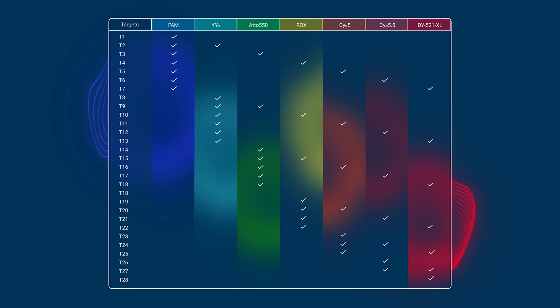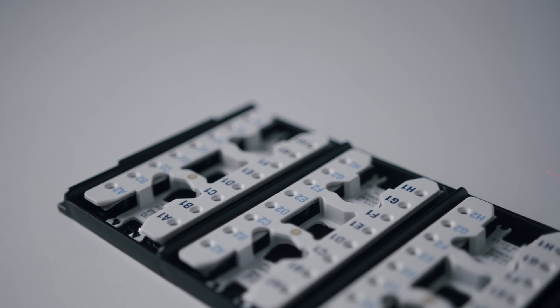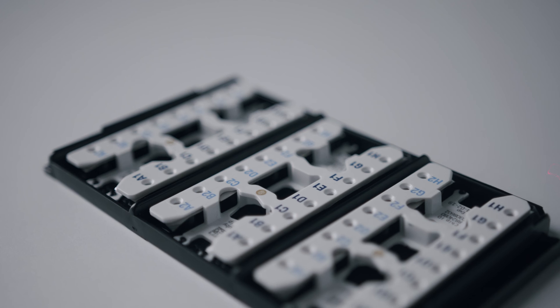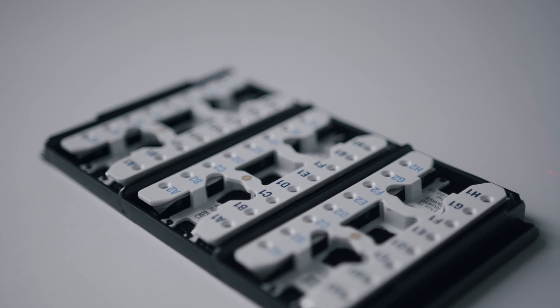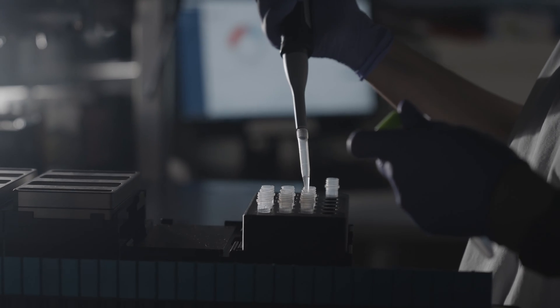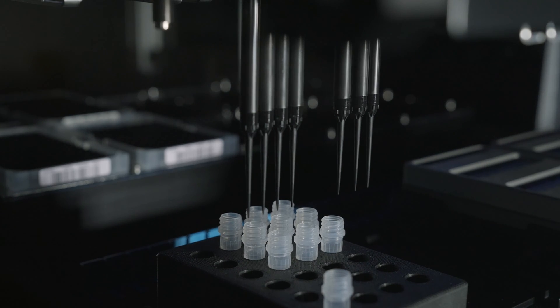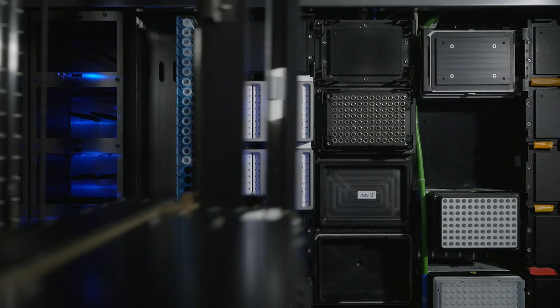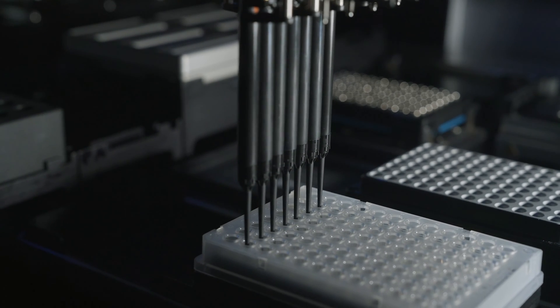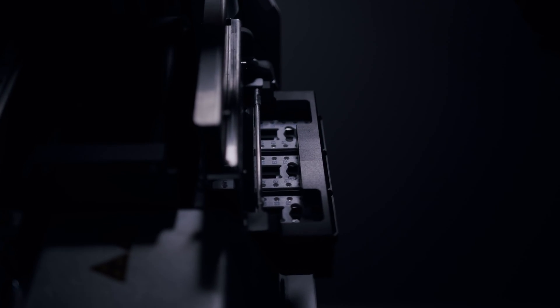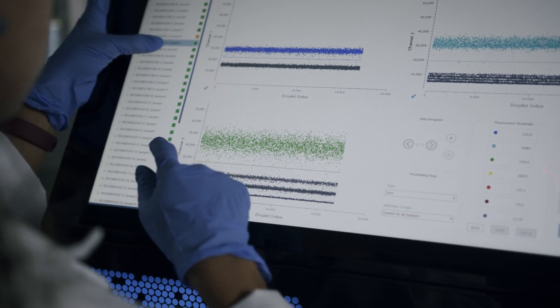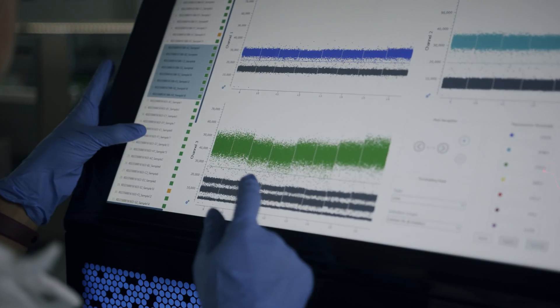And all this builds on our signature chip, Ruby. It's our most flexible and accessible digital PCR chip yet. It's much more sensitive than qPCR out of the box, and it's built to work much like regular plates. For experiments requiring even higher sensitivity, you can simply pool chambers and reach the sensitivity you require.